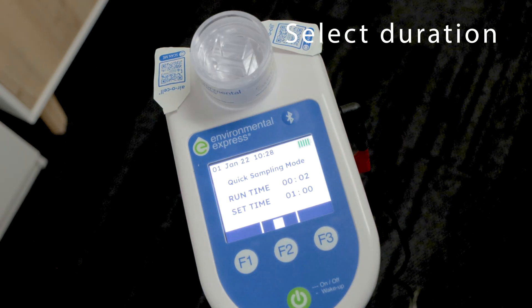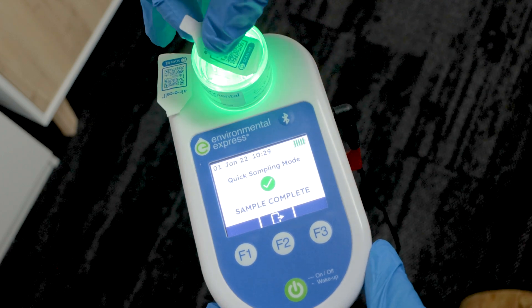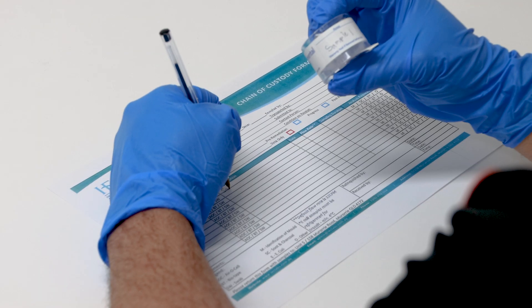Be sure to place the cassette onto the unit with the airflow indicator facing towards the pump. Select the duration of the sample and let it complete the test without moving the machine. Once completed, remove the cassette and place the stickers back on each side of the cassette. Repeat for any other sample you need to take.